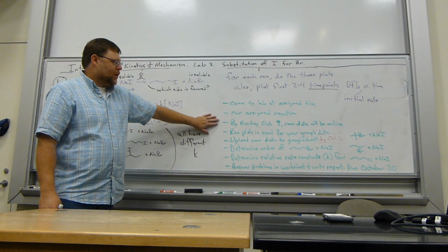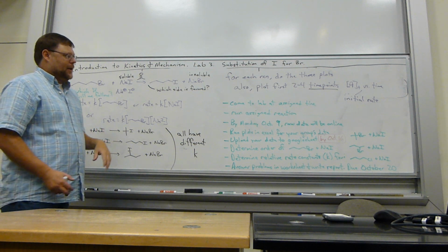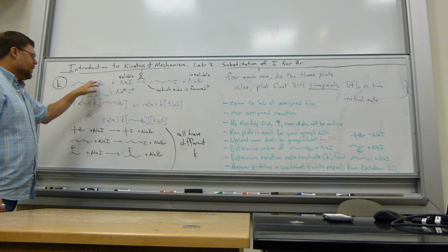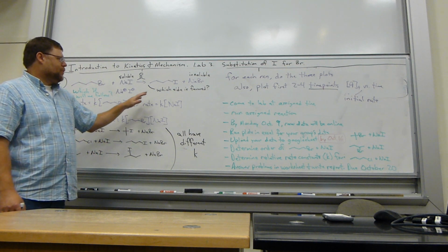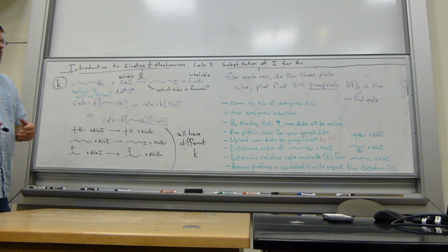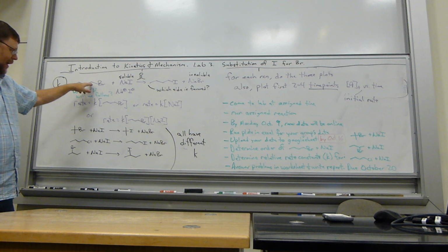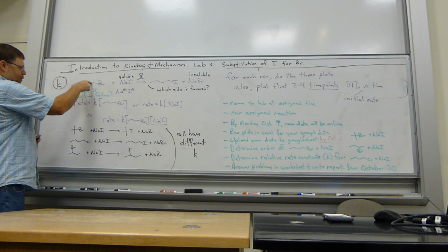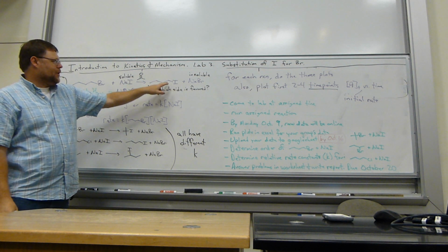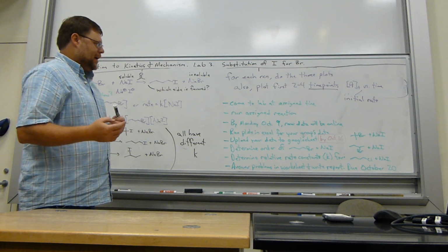Your TA and I will process the initial data, take it off the machine, and give you some raw data. The raw data are just going to be numbers. You will have an integration for one of these signals. You should again think about which one would be good to use. The lab write-up tells you how to normalize that. Let's say, for instance, that we use the CH2s bonded to the halide. You get an integration for this one at time 0 and an integration for that one at time 0. The sum of those integrations has to equal the concentration.